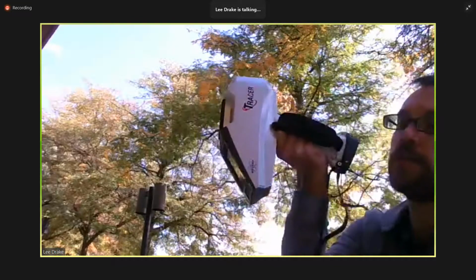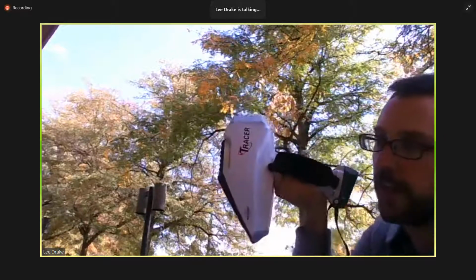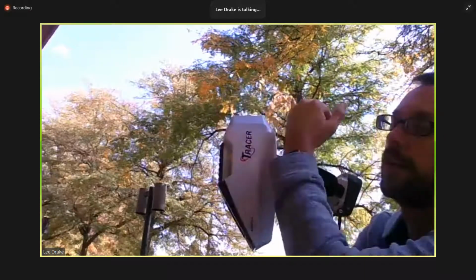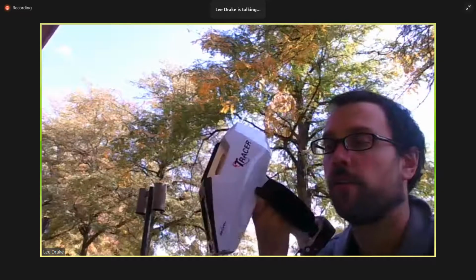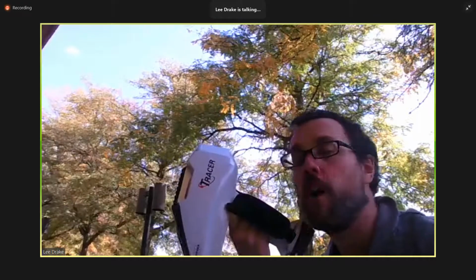So the X-ray tube is here, the detector is here, and right here along the flat is the focal point where we measure. This way we can have the photon source and the detector all in the same equipment.